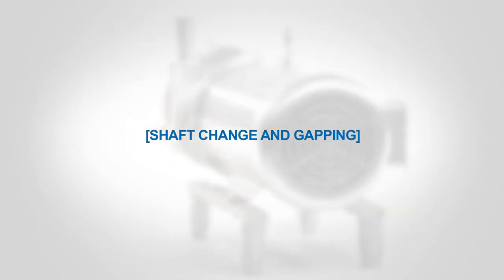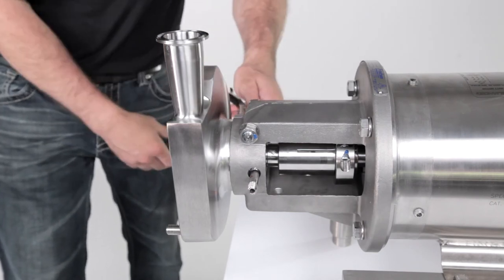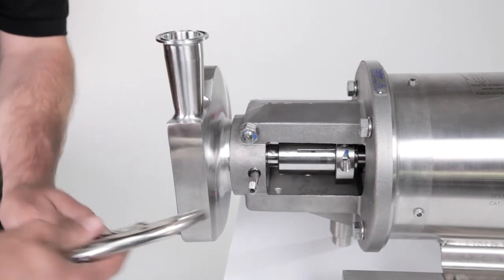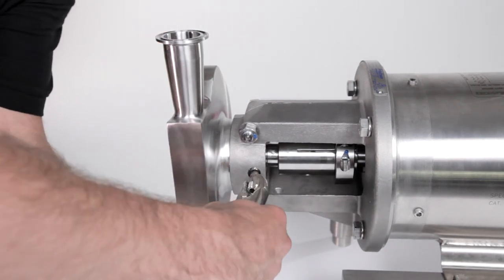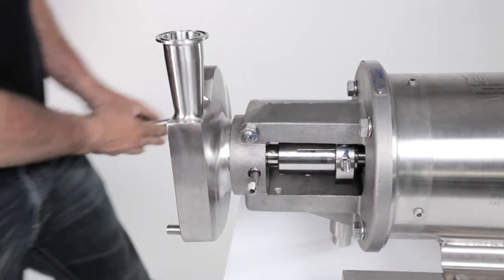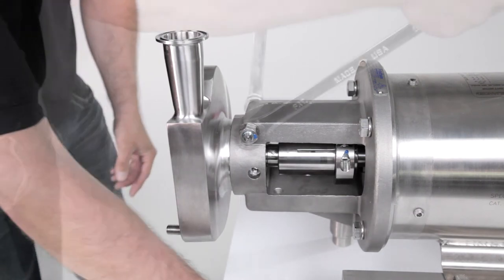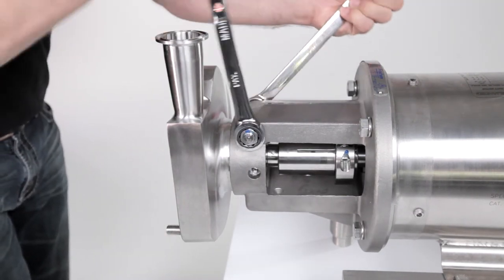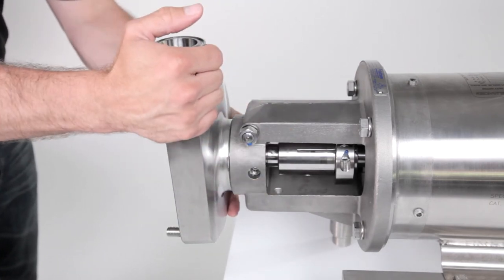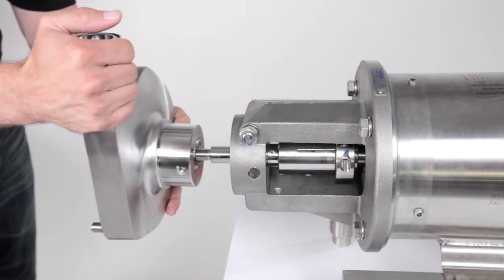Shaft change and gapping. To change the shaft, first remove the pump's cover, impeller, and seals as shown. Remove the seal water pipes on pumps with a double mechanical seal or water cascade option, using pliers. Loosen the housing clamping bolt with two wrenches until it is loose in the flange support — note that the clamping bolt does not have to be removed. Now slide the pump housing off the end of the pump shaft.